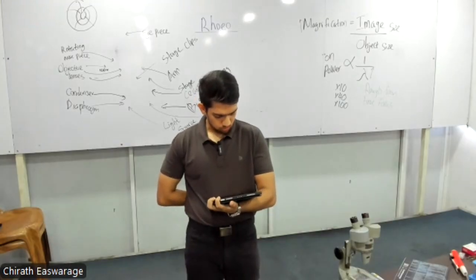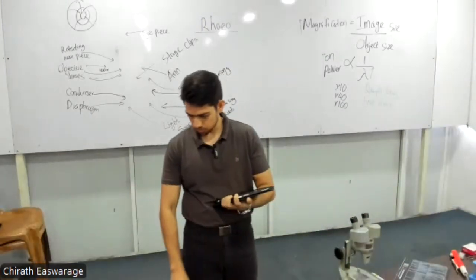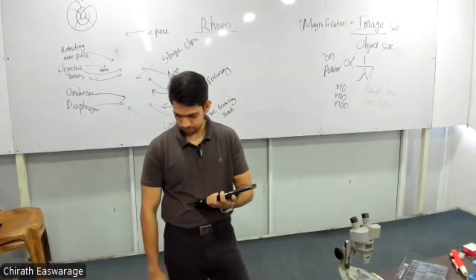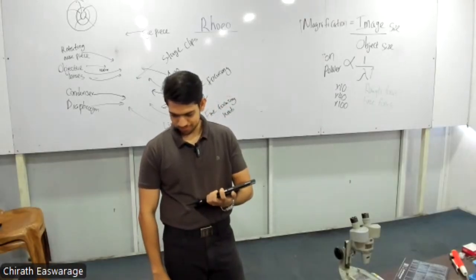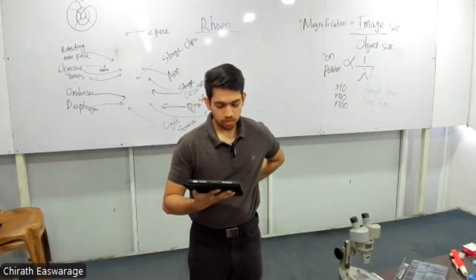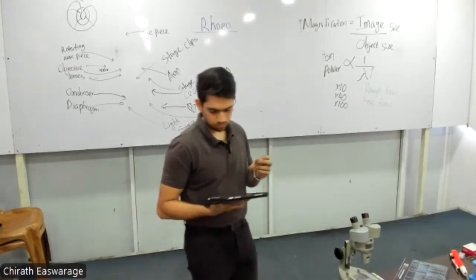Looking through the eyepiece, move the slide to bring it to the position of study.